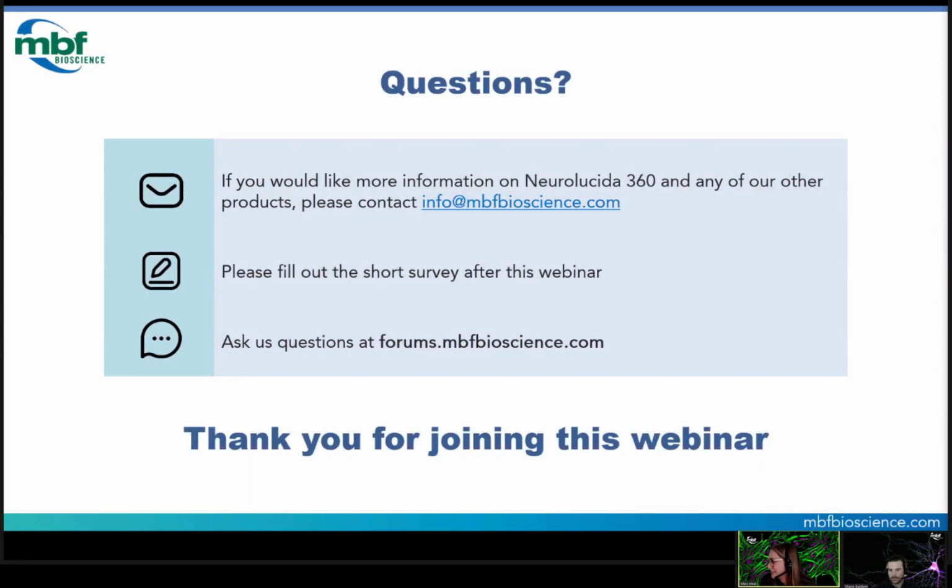And then lastly, can I try Neurolucida 360 out on my data? And the answer is yes, of course. We would love to talk to you about your data, provide you with a free trial so you can evaluate if it will help you in your research. Our team, Shane and I specifically, are available for giving demos of the software as well, and doing evaluations here to provide you with tips and tricks for getting the best reconstruction with your specific image data.